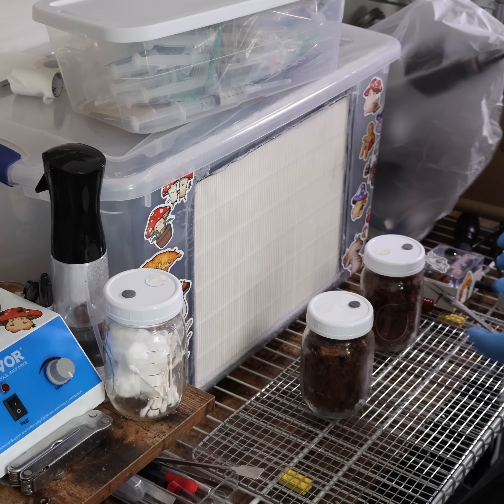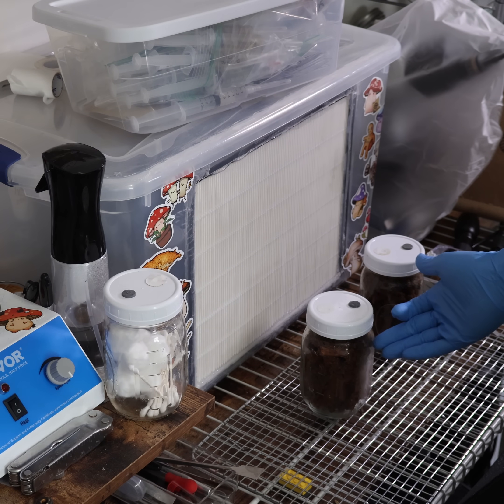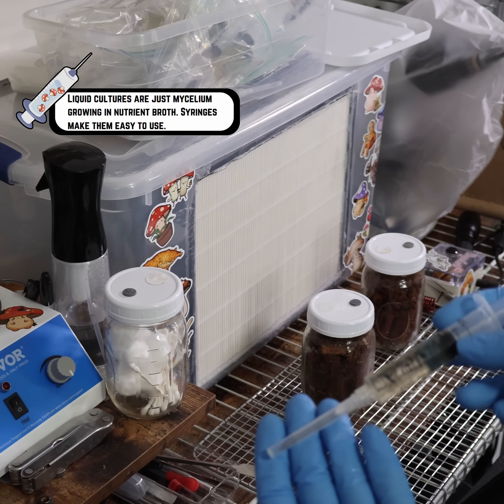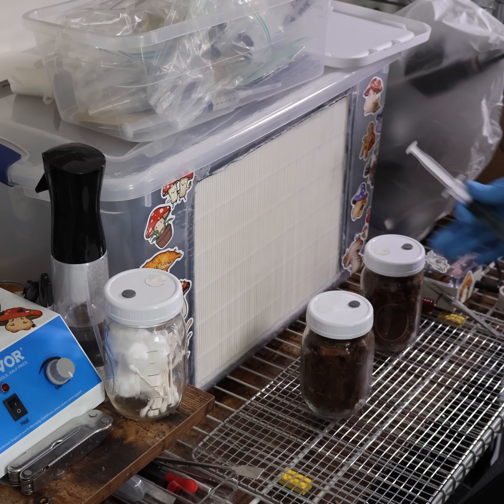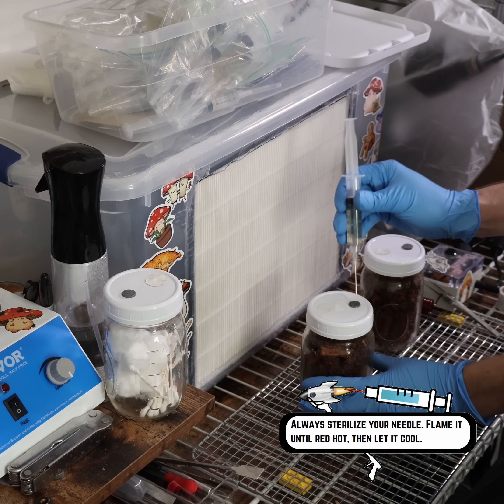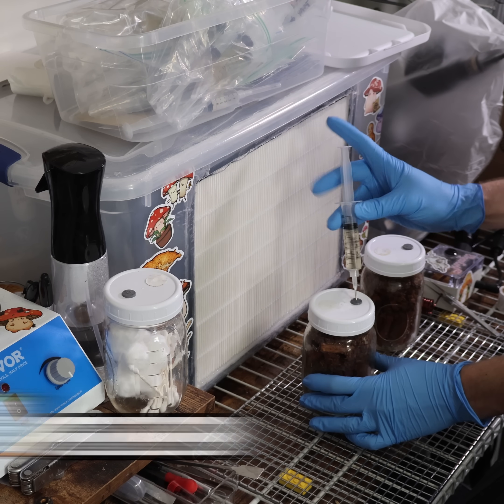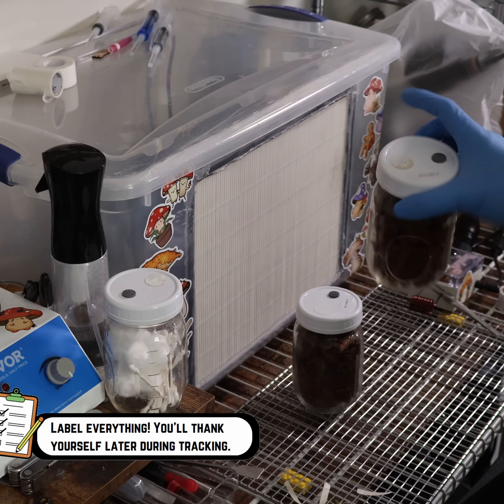Now we have both of our dowel jars with the oats and the hardwood fuel pellets. We are going to get a shiitake syringe — right here we have a shiitake syringe. We're just going to go ahead and inject a few cc's into the top layer of both of these. I'm going to sterilize my needle real quick, then we can inject a few cc's into both of our jars. That's good for storage — we can get those into incubation.